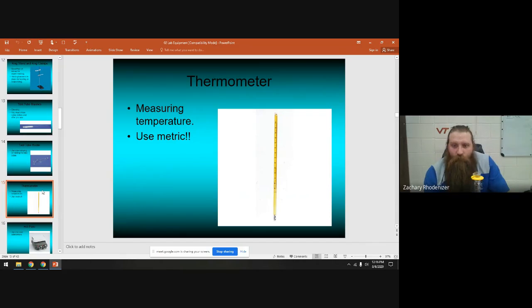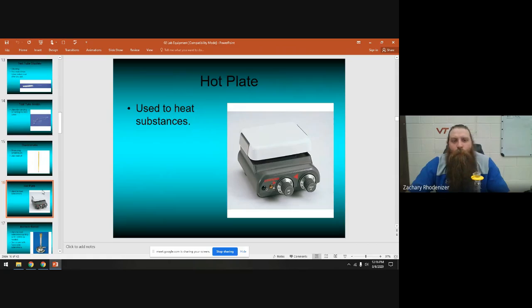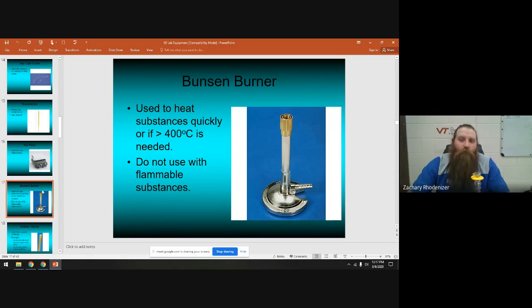A test tube holder is used for carrying test tubes and for holding a test tube over a flame to heat it — keeping your hands from getting burned. Thermometers are all in Celsius so make sure you record metric temperatures. A thermometer measures the temperature of an object. We have hot plates — they have a white top and knobs on the front — used to heat things. Assume they're always hot; don't touch them.